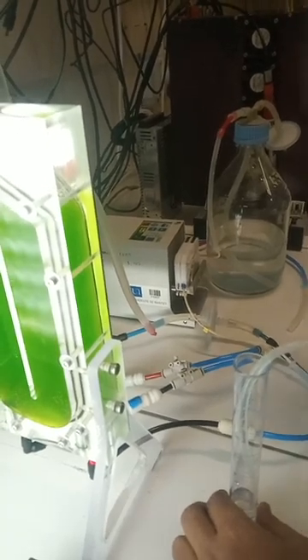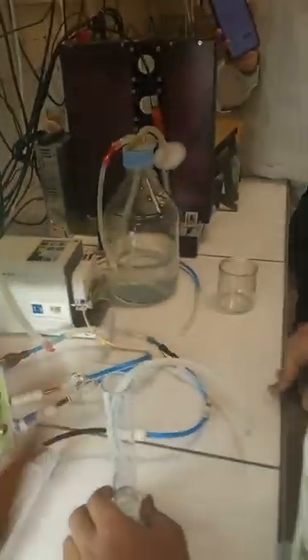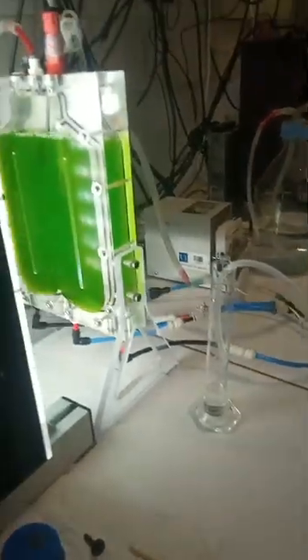1 minute 04. Start this. 1.04. Screenshot the time. 1.04. Quantity is 12. Write it down: 12 ml, just 5 seconds. 12 ml.